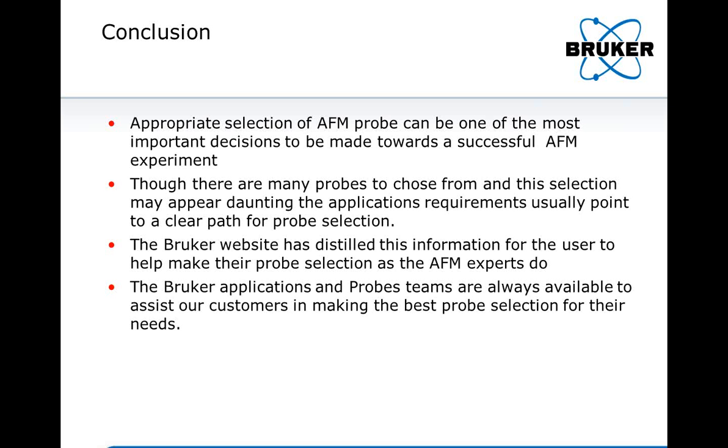Which probe would you suggest to study protein aggregation and aggregation structures on mica using PeakForce Tapping or ScanAsyst on an Icon? So for PeakForce Tapping, I would suggest using the ScanAsyst-Fluid+ probe. If it's too stiff, then I'd switch over to the SNL-D probe.